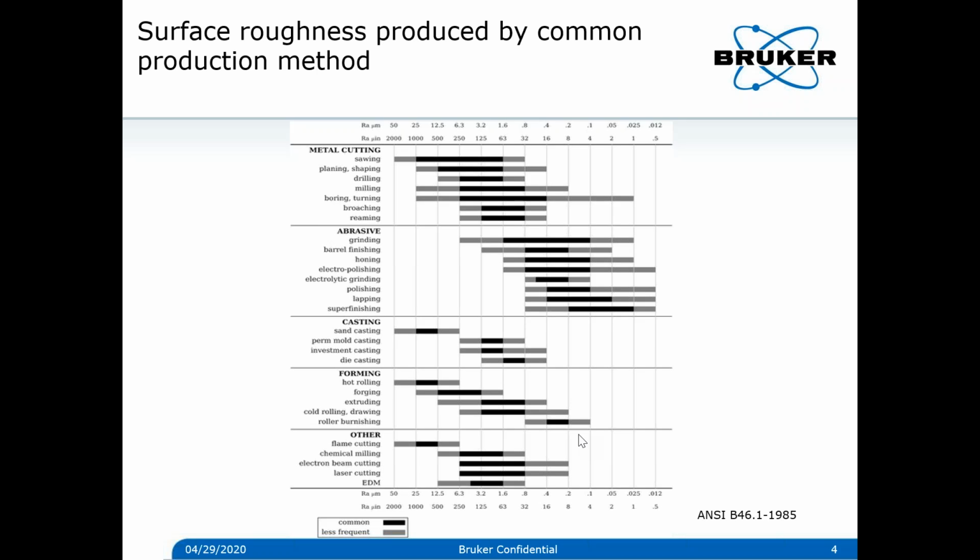The next question is, if we have a 2-micron stylus, can we measure the profile at nanometer level? We did not mention whether it's Z level or XY level, but Dr. Aisha, can you answer this question? So yeah, as mentioned rightly, we need to know whether it is XY or Z. If it is Z, yes, we can do it. But if it is XY, then it's going to be very tricky, because the detector has a resolution of around 1 angstrom, so you can actually measure the nanometer level in Z.